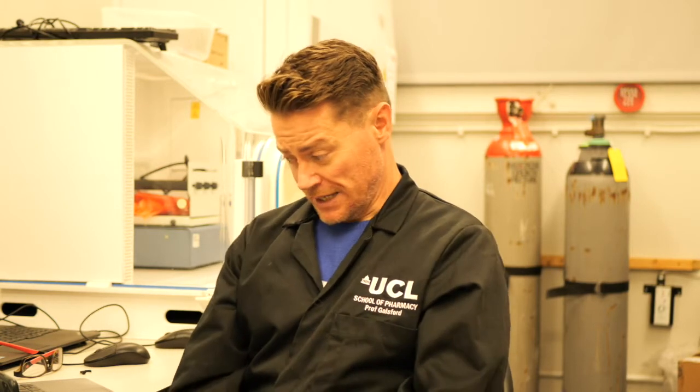So electron beams pass through the sample, they're then focused with your objective lenses, or magnets in this case, and then, as I said before, you can't look directly at an electron beam to image the sample because it will destroy your eyes. And so what normally happens is the electrons hit a fluorescent screen. The fluorescent screen then produces light in response to an electron hitting it, and that light is then transmitted to the ocular lens.